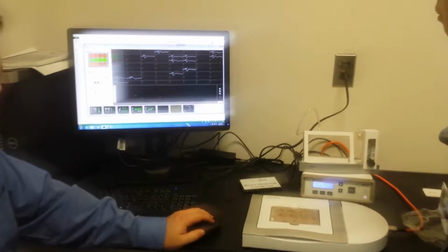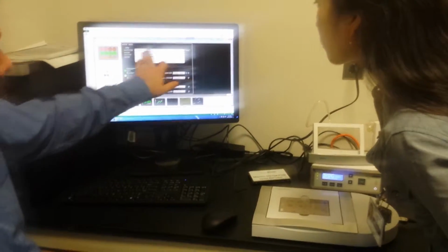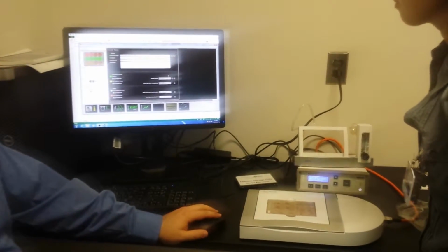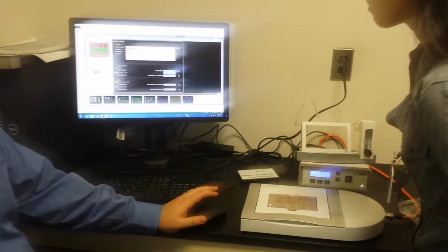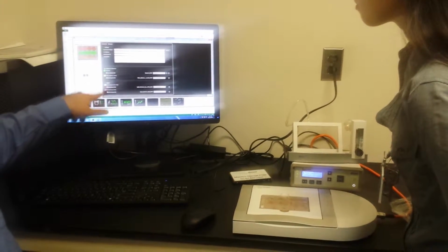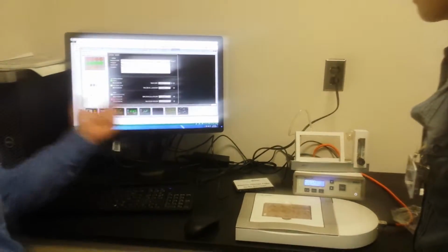All right. So now if we go to the save disk icon over here, you need to have an experiment folder. These fields are optional, but just more information to keep track of things. And all we need to record is the access raw. There's a drop down, not recording or access raw, and it's coming from the Maestro. We've also got this filter, spike detector, burst detector. All these things are just software for the displays.